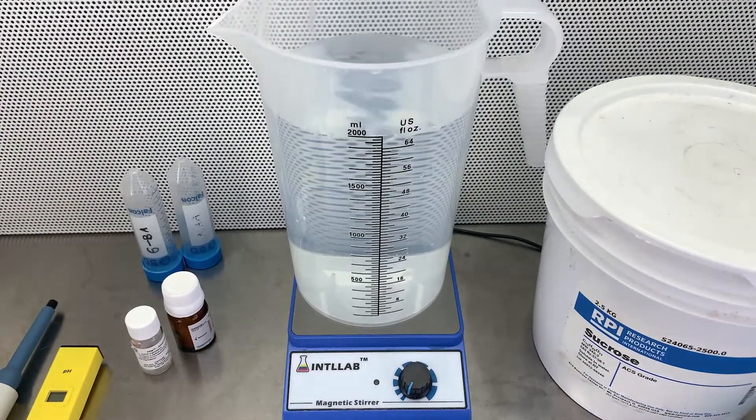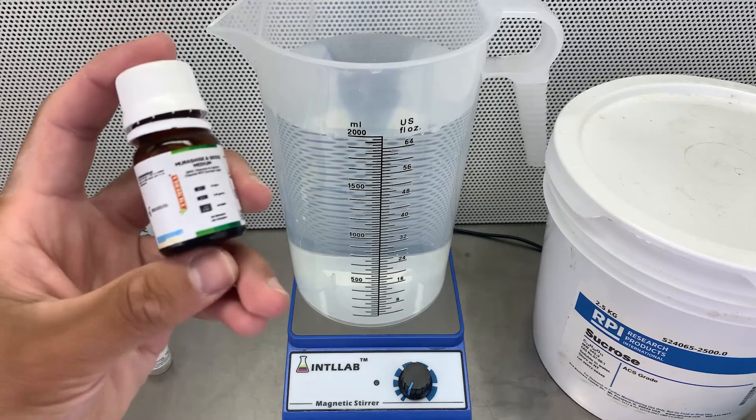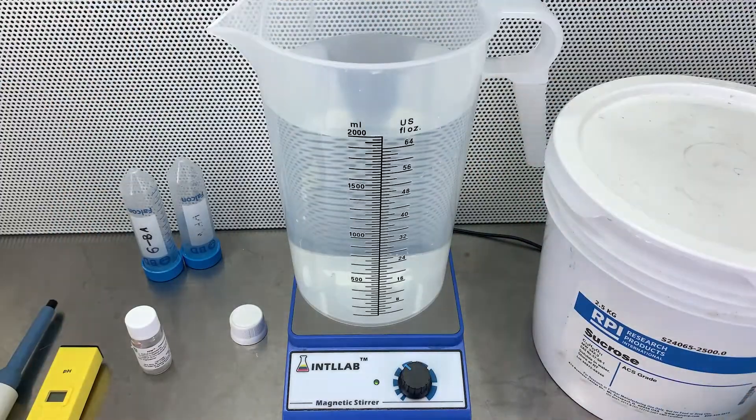Welcome back to another video on the temporary immersion bioreactor series. This time we are working with Heliamphora minor, and this is one of the plants I've been wanting to introduce to a temporary immersion bioreactor for a while. I finally got enough plants to do so.